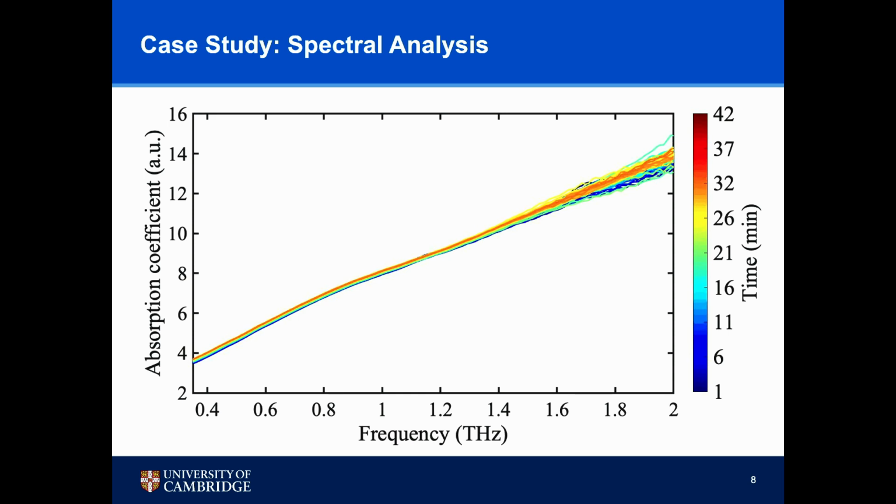And when time goes by, the crystal starts to build up. That's when we start to see peaks showing up around 1.6 terahertz, because the vibrations of the crystals are coherent, and it's more refined to a certain temperature. In other words, refined at a certain frequency. So by the peak emerging at 1.6 terahertz, we can see the onset of the crystals.